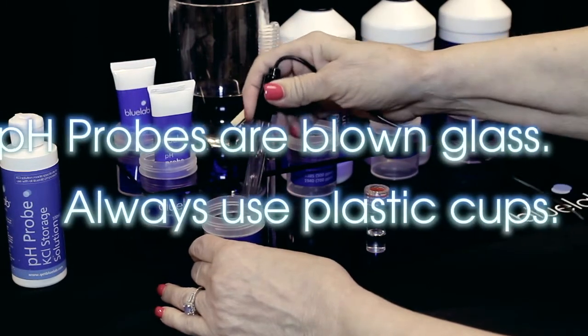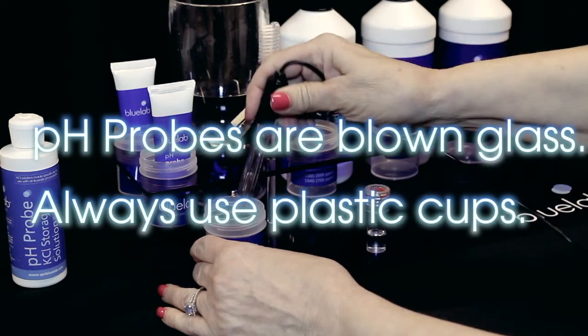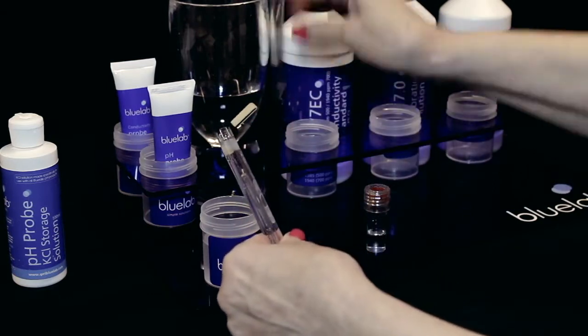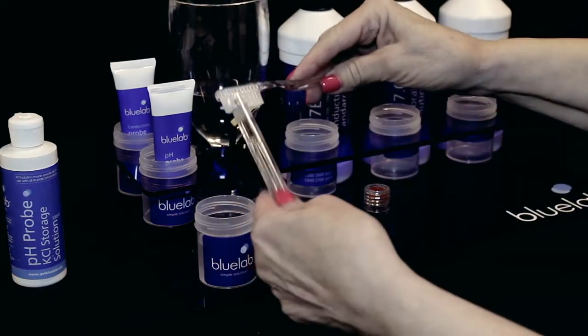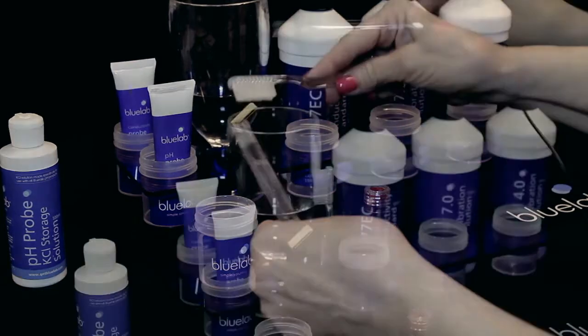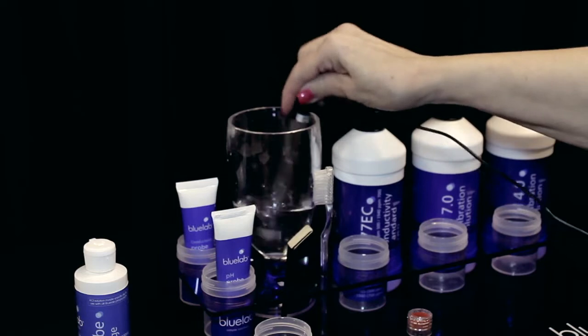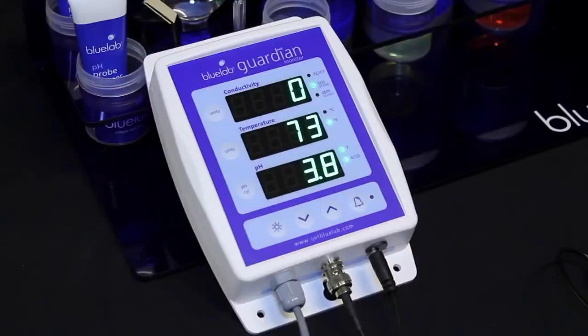pH probes are blown glass and are fragile. When cleaning and calibrating, always use plastic cups. If the pH probe is heavily contaminated, take a soft toothbrush and dip in cleaning mixture. Gently clean around the glassware. Immediately rinse the probe tip thoroughly in clean tap water to remove all traces of cleaning mixture. You'll know it's time to calibrate the pH probe when the two green pH LEDs are flashing.